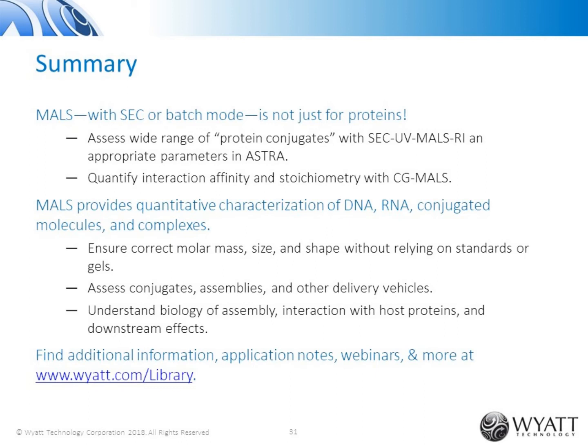So we've had studies and we have customers that use a variety of techniques and can compare the two of them together. We typically get also very good agreement with SPR as long as, like I mentioned before, as long as the surface isn't influencing that interaction. So as long as your analyte isn't either non-specifically binding or caught in some kind of avidity effect.